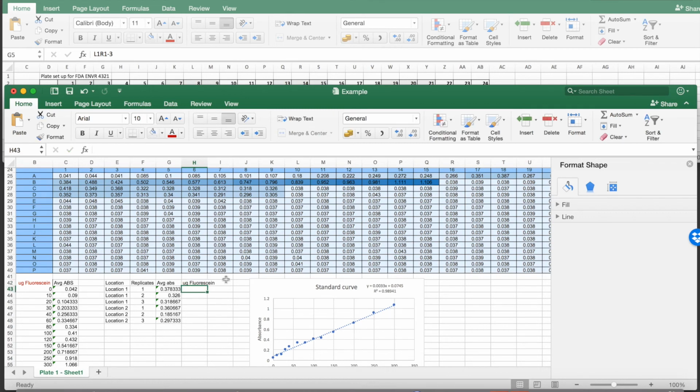So we can plug in this equation with these absorbance numbers. When we plug in our numbers into this equation, we already have the Y number. We need to find X. We need to find the concentration. So we have Y, but we're going to find X, okay? So let's start by entering the equal sign. Our Y is the absorbance.